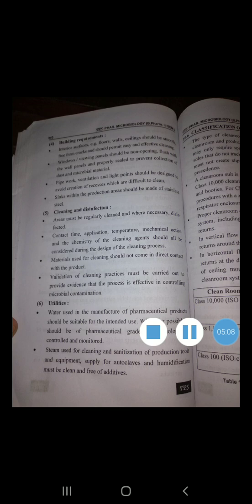The next point in the syllabus is classification of clean areas. The type of clean room garments used should reflect the clean room and product specifications. Low level clean rooms may only require special shoes having completely smooth soles that do not track in dust or dirt. However, shoe bottoms must not create a slipping hazard, since safety always takes precedence.